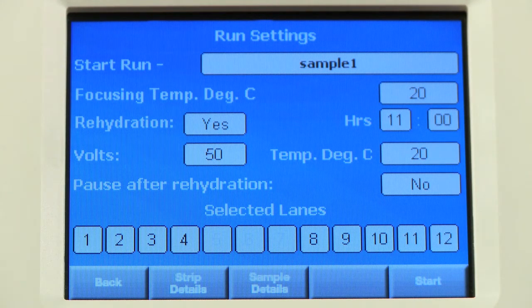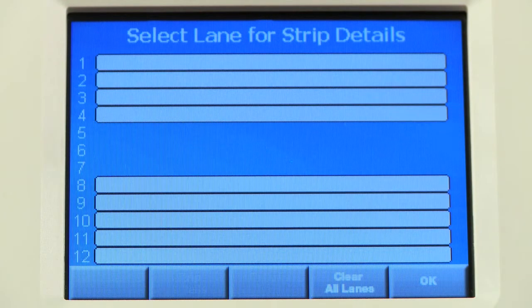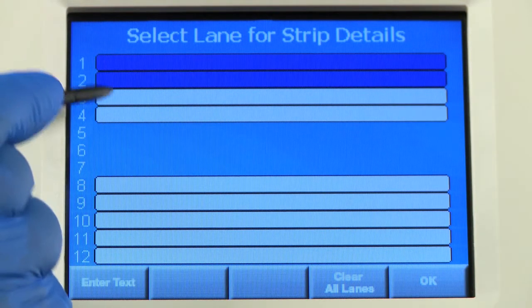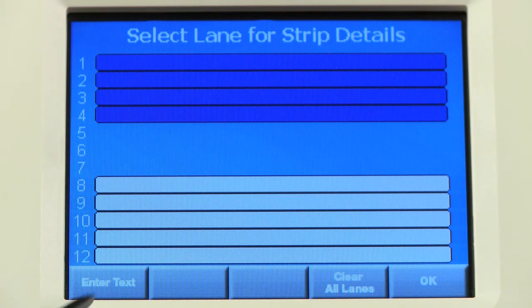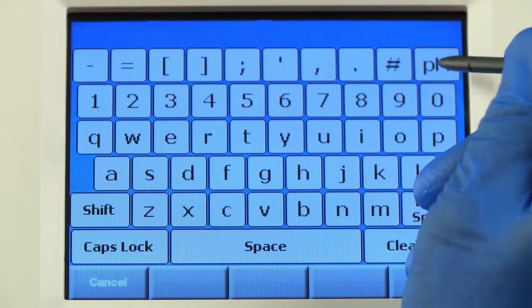The selected lanes show which lanes have been assigned a protocol. Press Strip Details if you would like to add information about the strips, such as pH range or lot number.